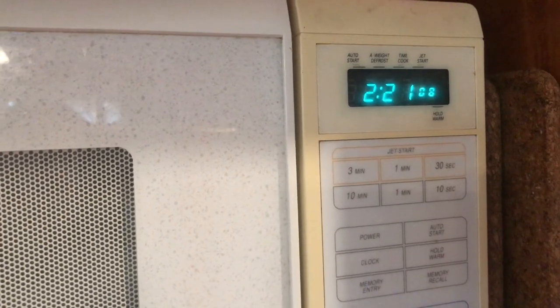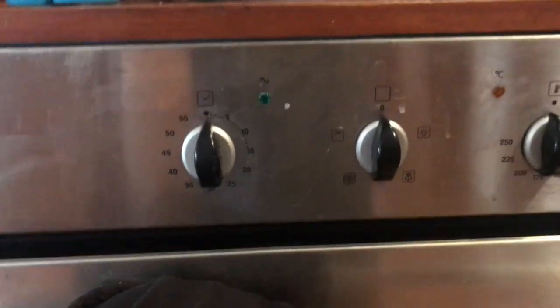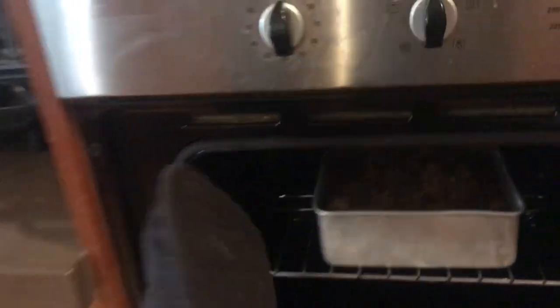Here we are, back again 2 hours later. We've turned our oven off and now it's time to take our soil sample out.